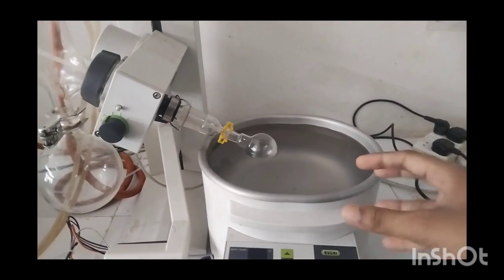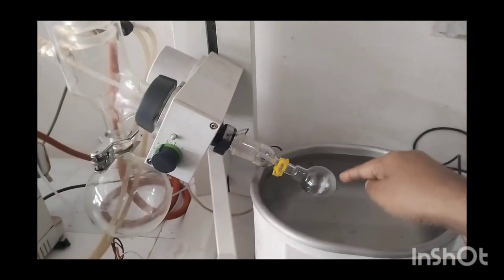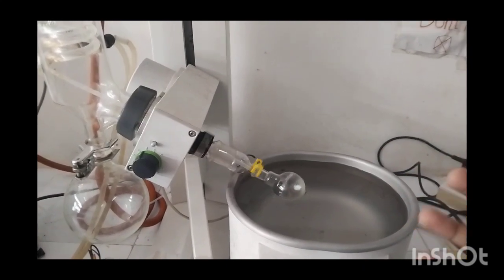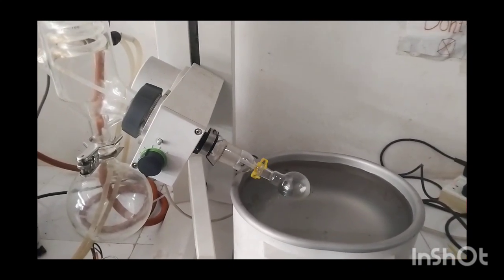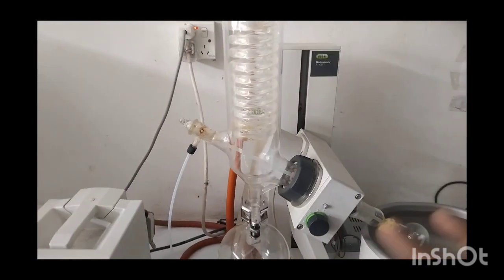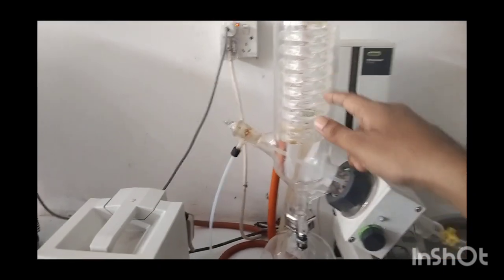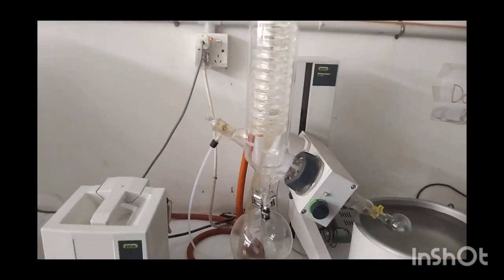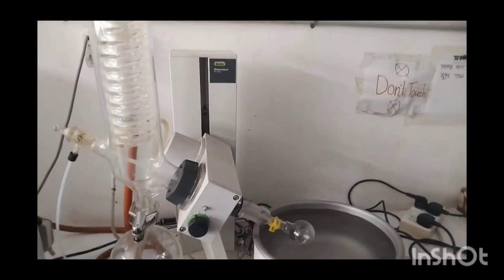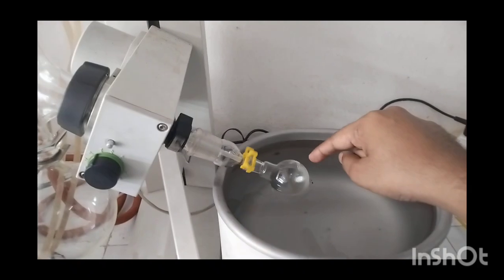At first we are seeing that in the first portion, that is the heating bath, it will heat this specific amount of water, and when the water is hot, it will transfer the heat to the RB bottle, and it will vaporize the overall mixture. And when the vaporization is done, then this vaporized molecule will be condensed by contact with the cool water in this specific tube.